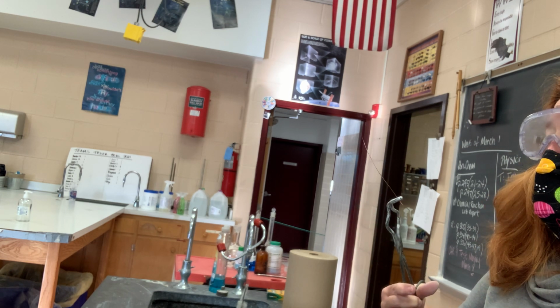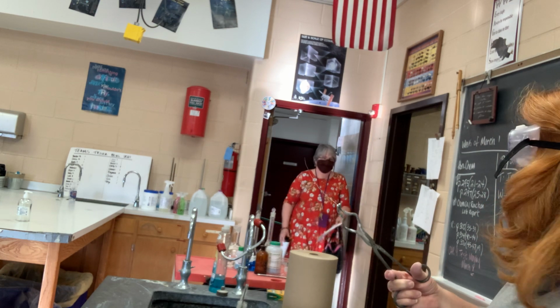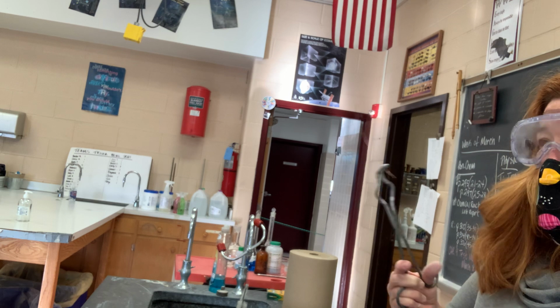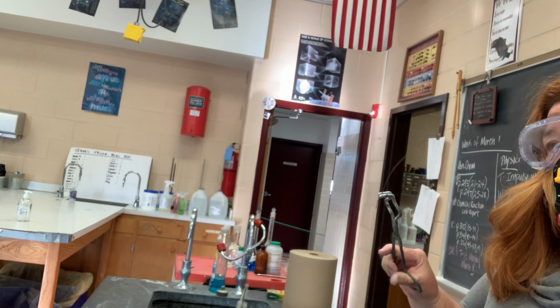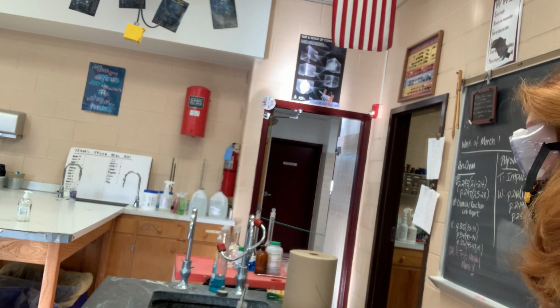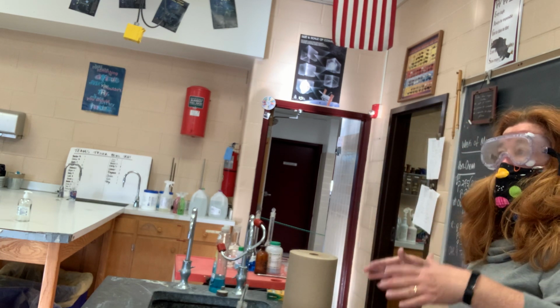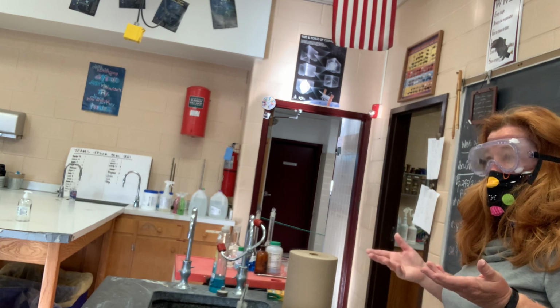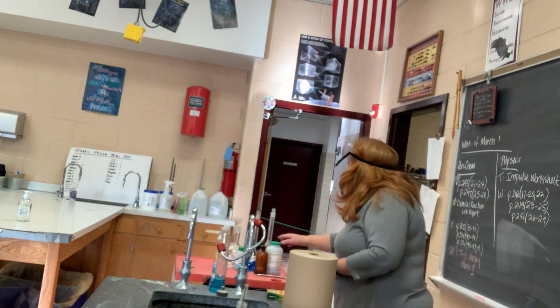So once again, synthesis reaction. We started with copper, it didn't catch on fire, but it did react with the oxygen in the room, like the magnesium did. That was a hint. So that's part B. And then you will write the evidence of a chemical reaction, and the balanced synthesis reaction for that. We're not going to do decomposition.